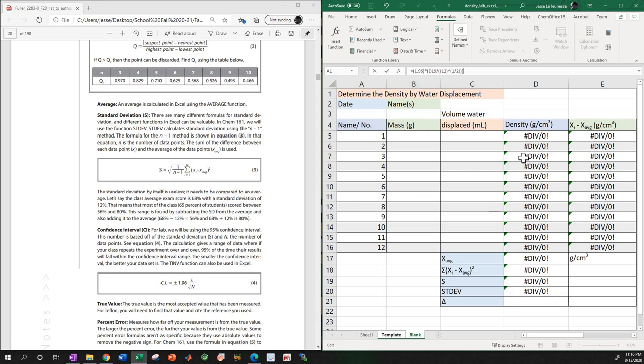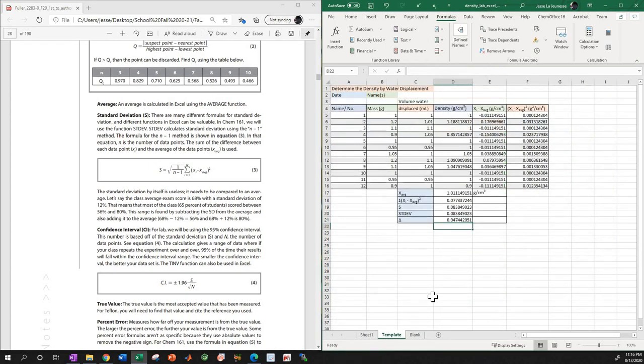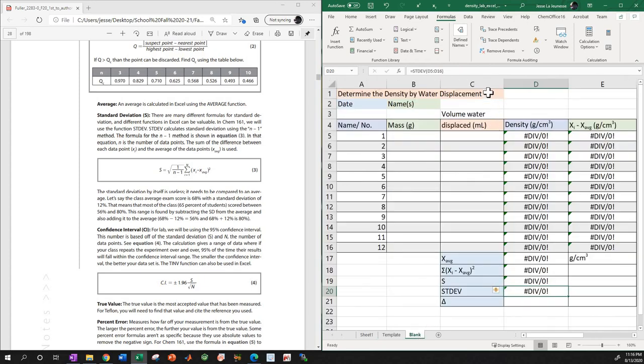Alrighty, cool. And even though I got the script from a different sheet, it's using the same language. I have the things in the same place, and so it should do what I tell it to. Okay, what did it do? No, it did not do what I wanted it to do. Oh. Okay, there it goes. Again, sometimes Excel is haunted. It doesn't exactly do what you want it to do.